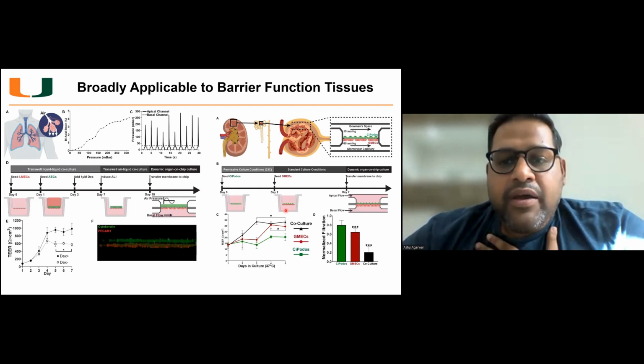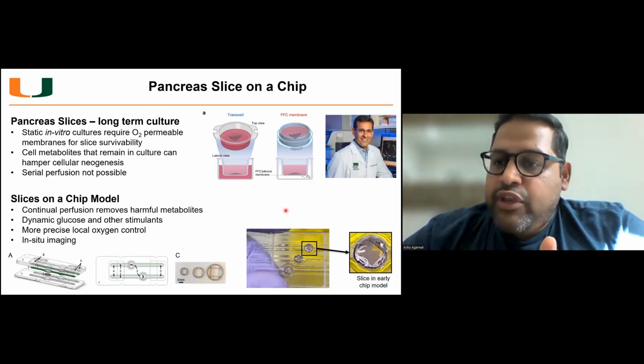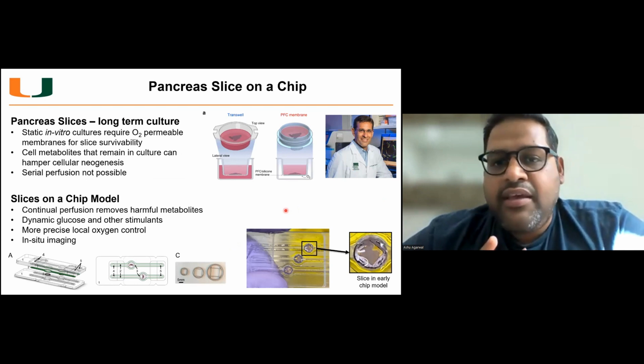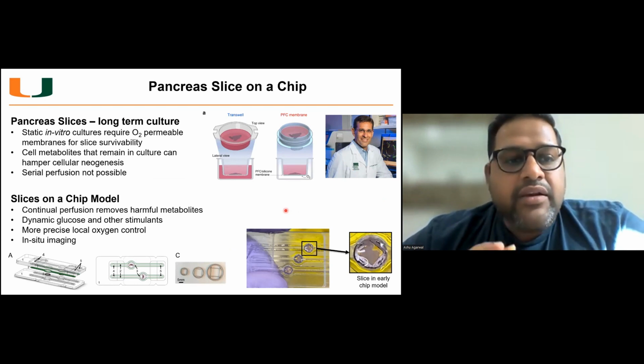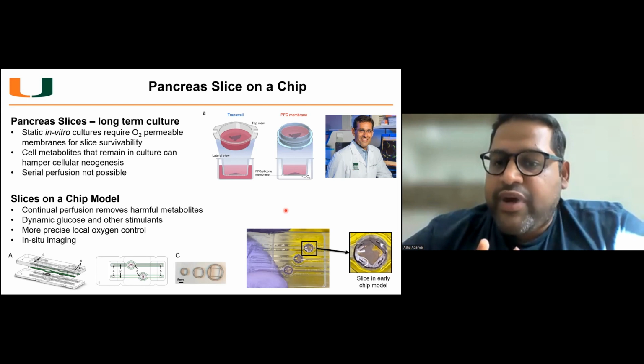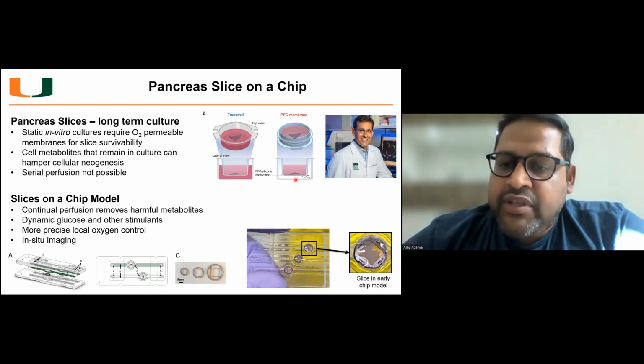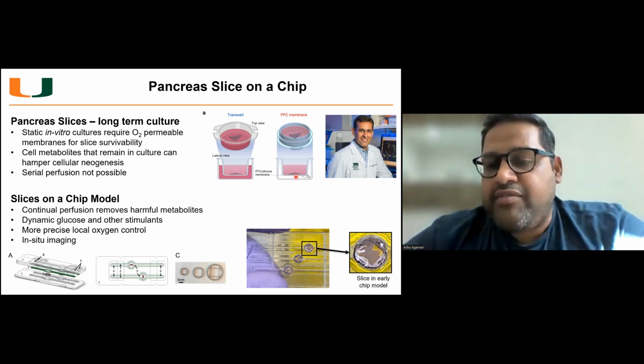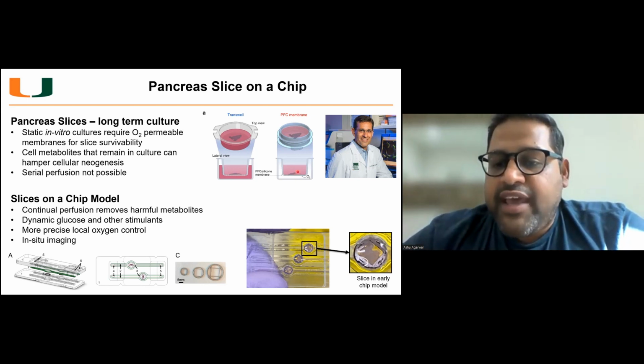Now, I'm just going to switch gears and introduce a new biospecimen that was popularized by my colleague here at Miami, Juan Bendala Dominguez, who's on the call, I think, where he pioneered long-term culture of pancreatic slices by discovering that you really need local oxygen environments to be maintained in a pancreatic slice culture. So from a few hours, he took the life to a couple of days, by just having, similar to our devices, a floor that was oxygen permeable.